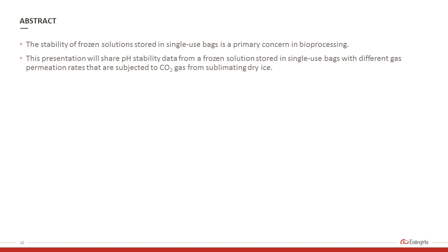In order to address these concerns, this presentation will present pH stability data from sodium phosphate solution that has been frozen in single-use bags with different gas permeation rates and placed into chambers with sublimating dry ice that give off CO2.